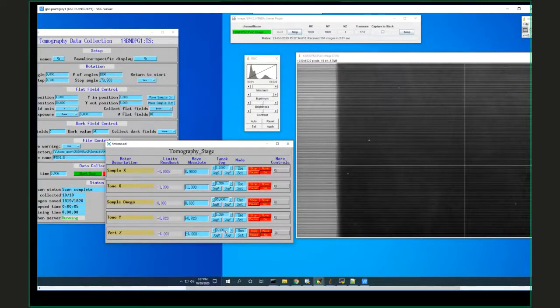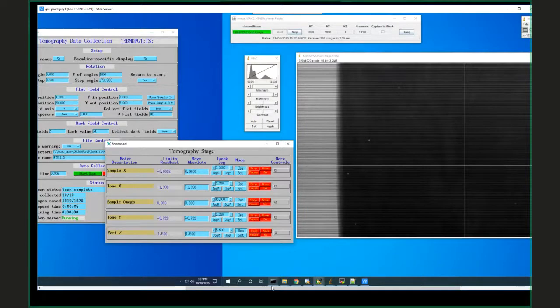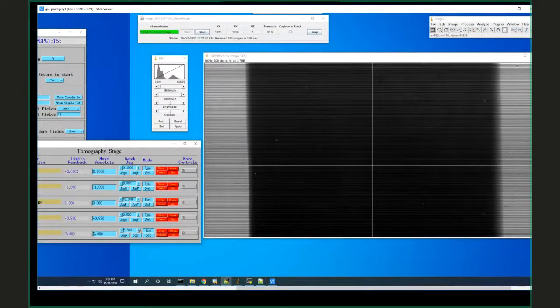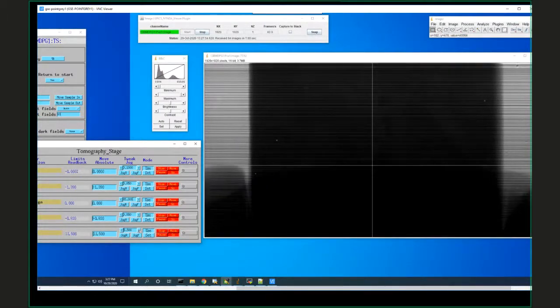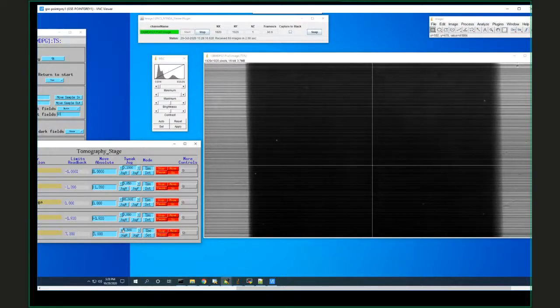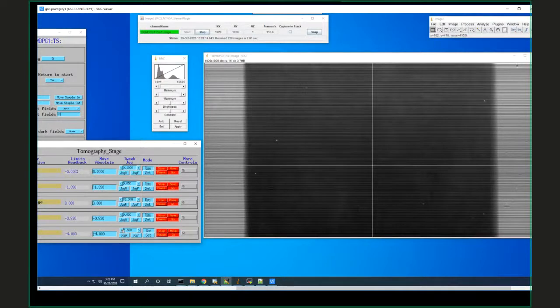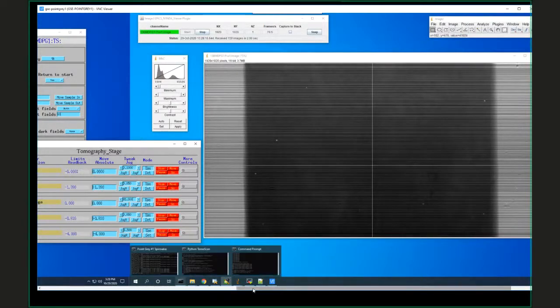So if I set my step size to move the motor by 5.5 millimeters, that's now the height. And if I move another 5.5, and another 5.5, I'm now down into that plasticine at the bottom. So I moved it altogether three times, right? So that would be four data sets. So there's minus four.